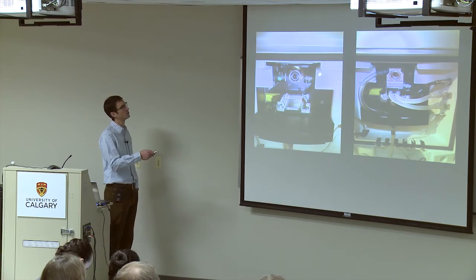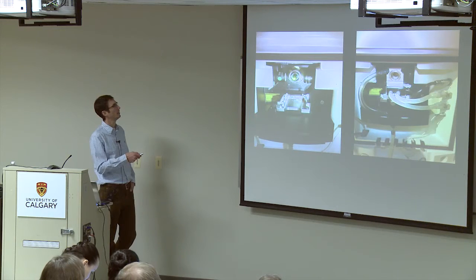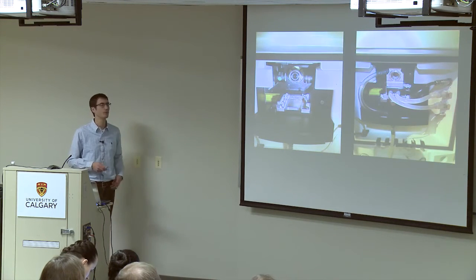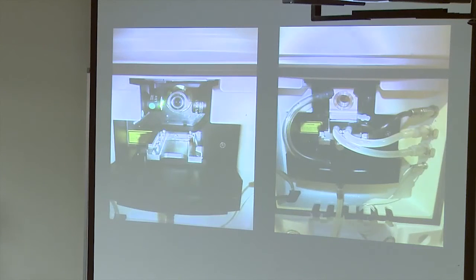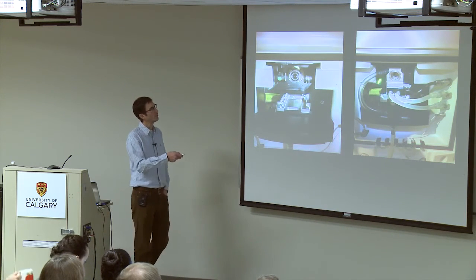These two little black objectives on the sides are the Lightsheet objectives that are projecting in our excitation light. They're going to be focusing it right here in the middle of this objective, which is our imaging objective that's collecting the light at the back. This is the 5x objective, an air objective that sits outside of the sample chamber. There are also some water dipping objectives that you can get that go in here, and they actually fit right into the chamber and form sort of the fourth wall of the chamber. This is the imaging chamber over on this side.